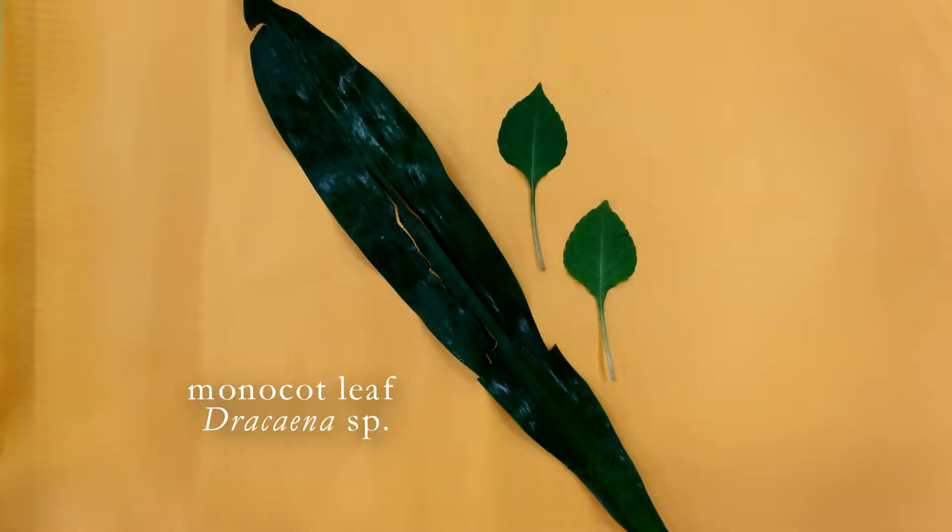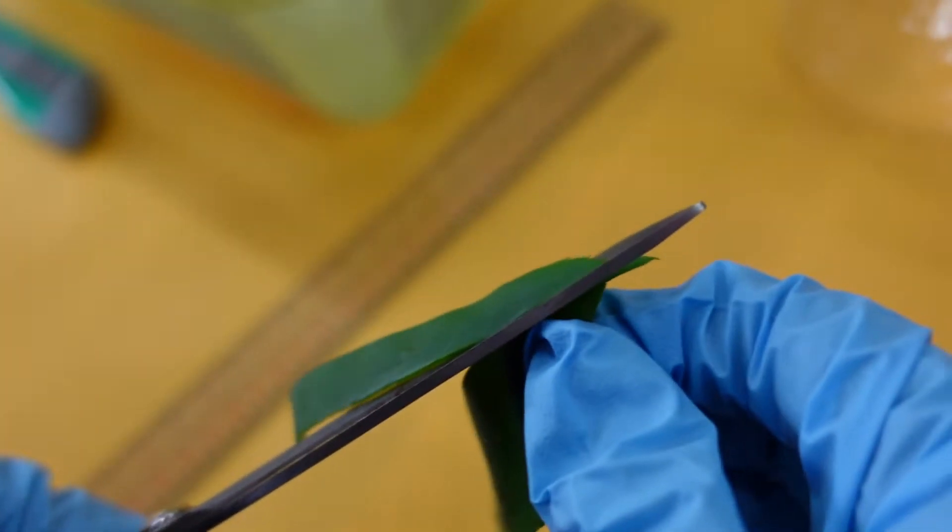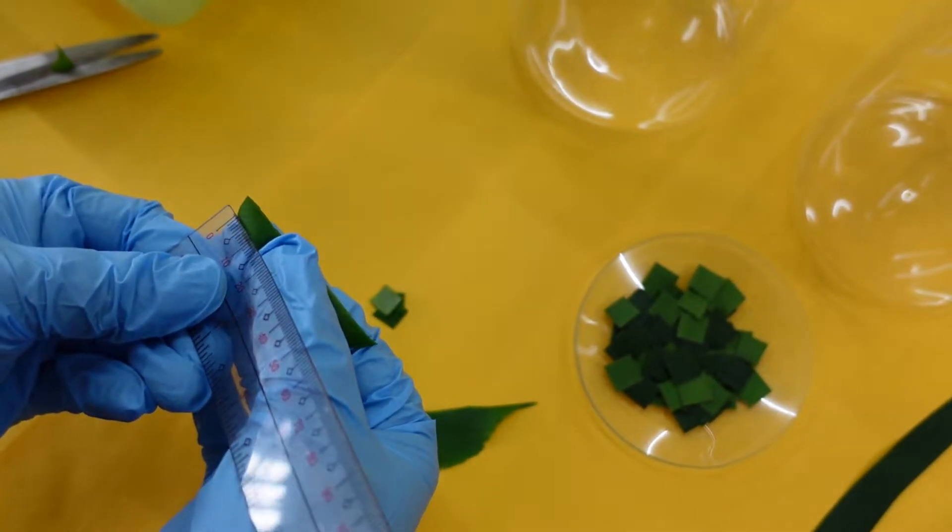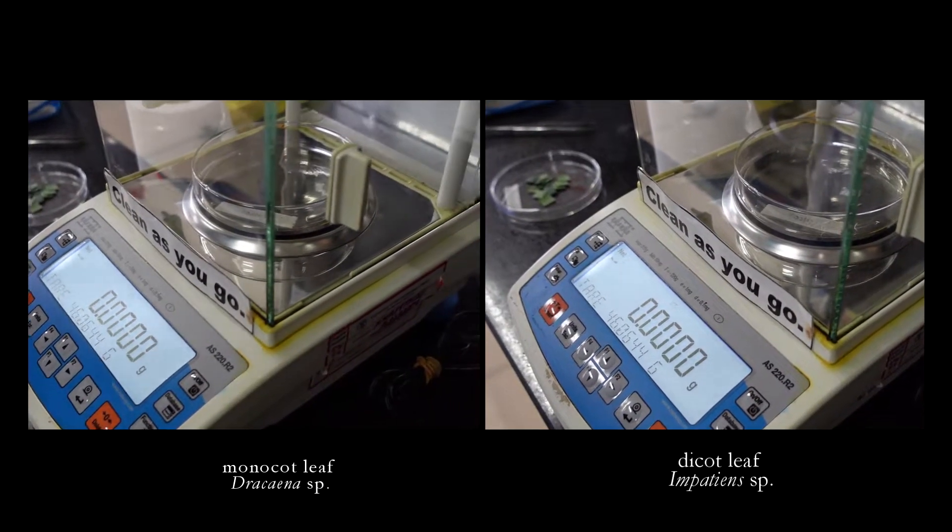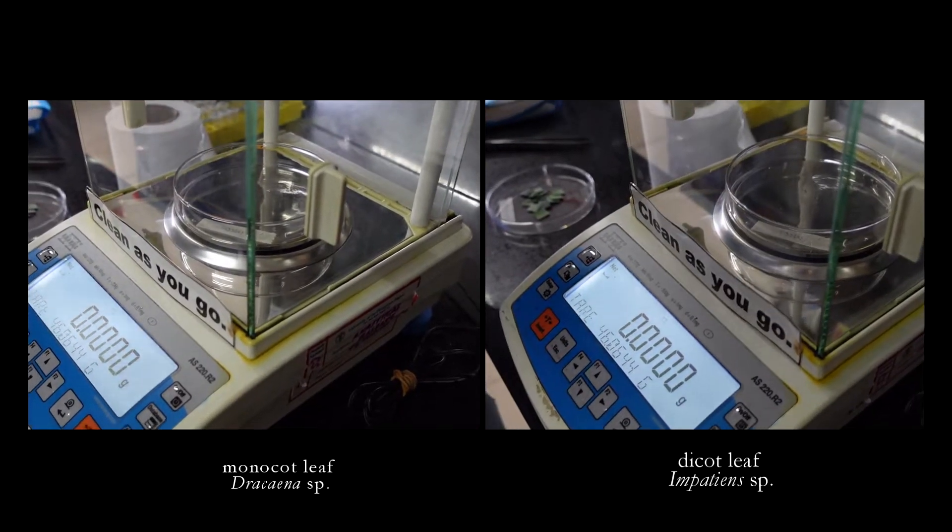Gather leaves from a monocot plant and a dicot plant. Cut these leaves into 1 cm² dimension and weigh 0.5 grams of leaf from each species.